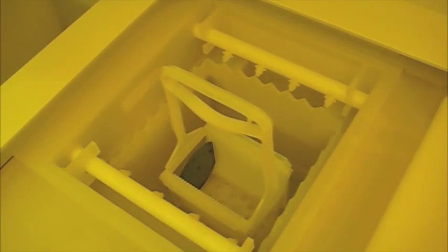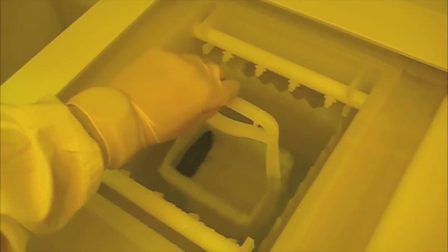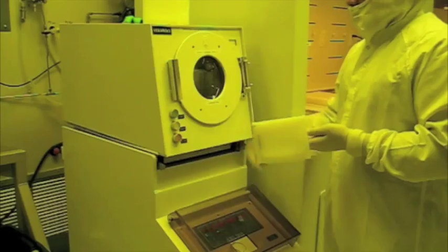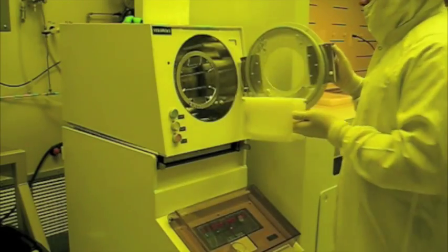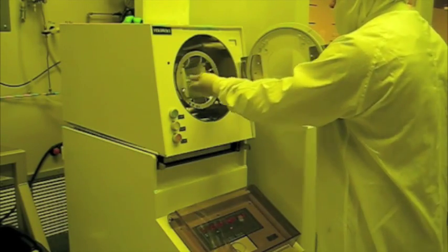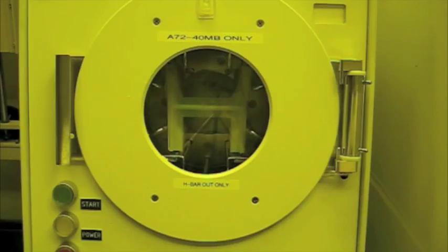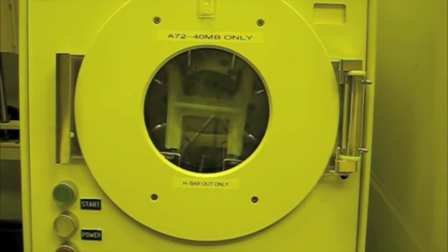A quick dump rinse washes away the alcohol and any other contaminants on the surface of the wafer. The wafer is then dried using a spin rinse dryer rotating at 2200 RPM.